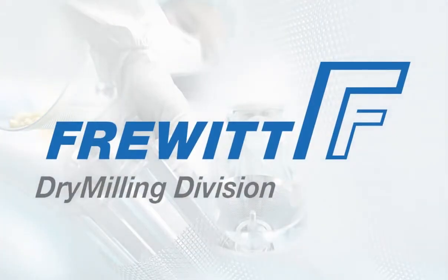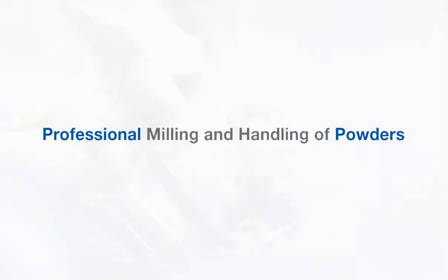Frewit Dry Milling — your worldwide partner for milling and screening systems in the pharmaceutical, food, and chemical sectors.